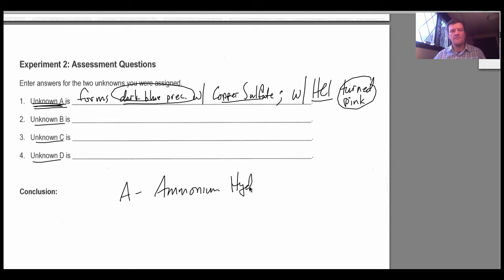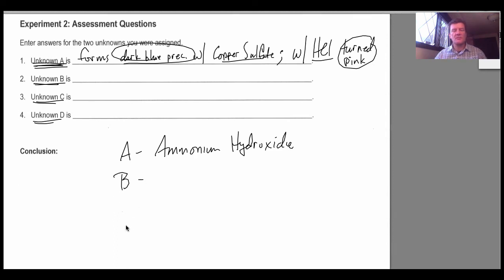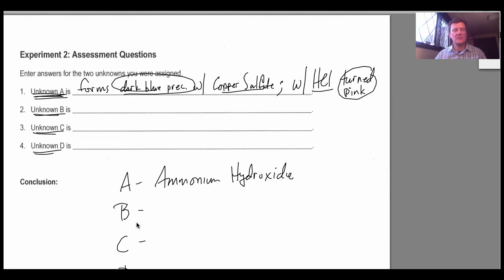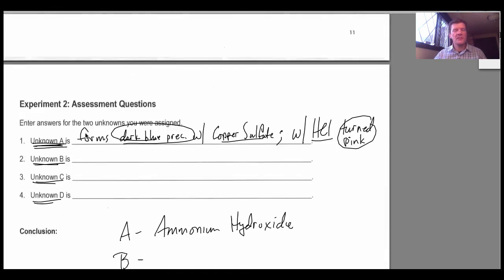All right. So I'm going to give you, for those of you that can't perform this experiment, some of the results when we take unknown B and react it with something, unknown C and react with some things, unknown D, and then you're going to have to tell me what you think. Look at the table and you tell me what these different unknowns are to the best of your ability. Okay? All right, unknown B.